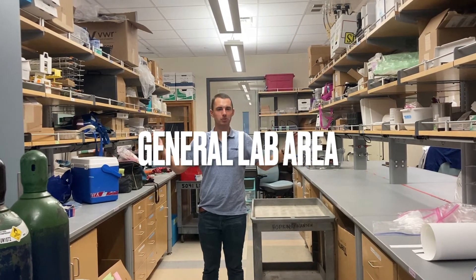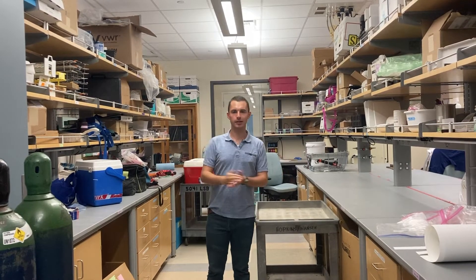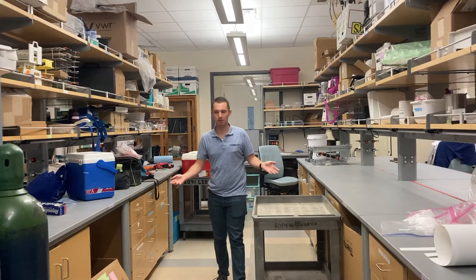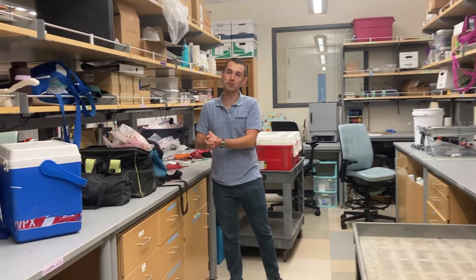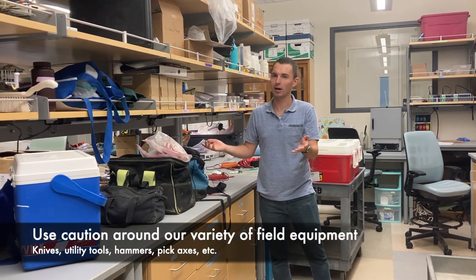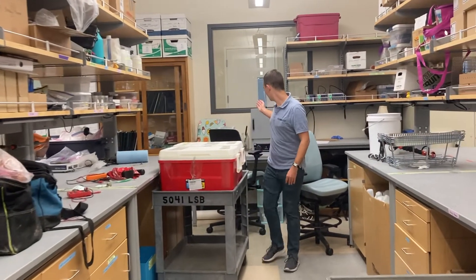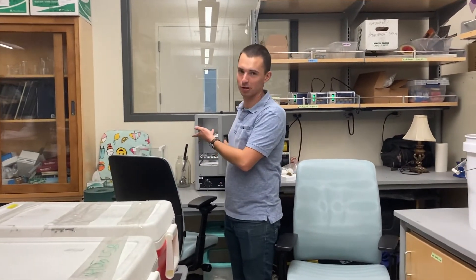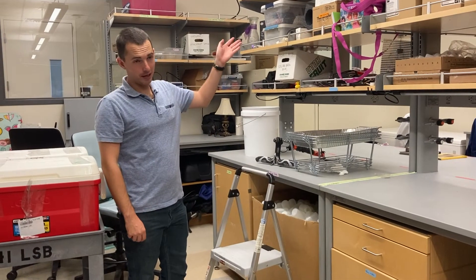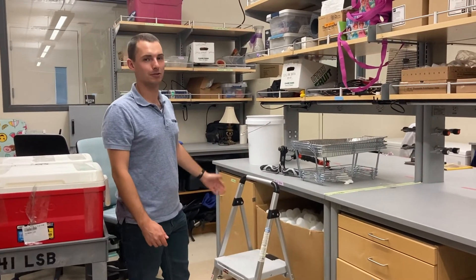This is our general area of the lab, where we have counter space for different things — you can lay out dishes to be cleaned here. It's a multi-purpose area where we also store some of our sampling bottles and other equipment. Field equipment is kept in these bags, which contain different chemicals and tools — just use common sense, be careful, and don't touch anything sharp. Over here is an oven — ovens are hot, so just use precaution. If you ever need to reach a high place, we do have a ladder. Please do not try to stand on rolly chairs — that's an accident waiting to happen.